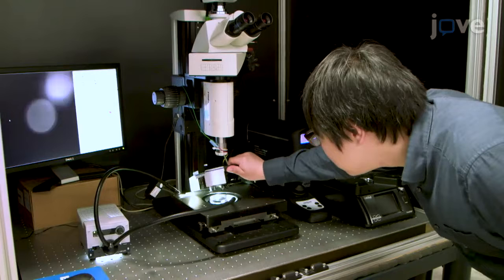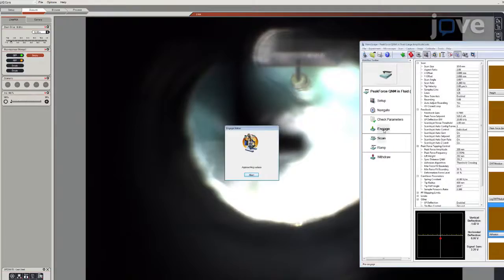Visual demonstration of this procedure is critical to better understand the intricacies of sample fixation, quality control of the force curves, and measurement setup.